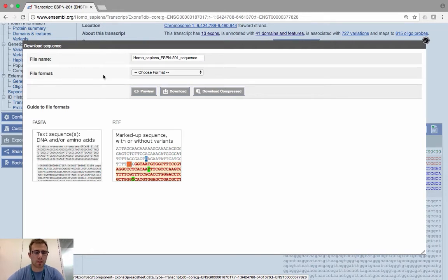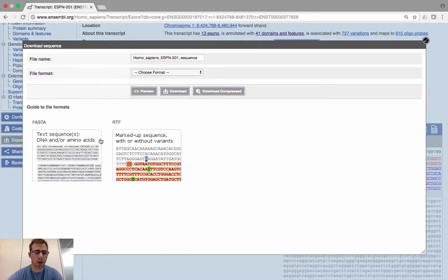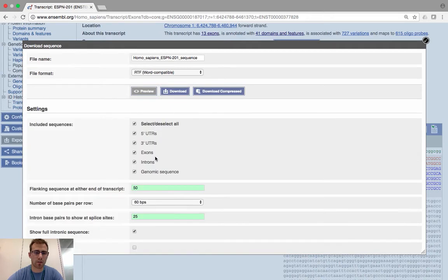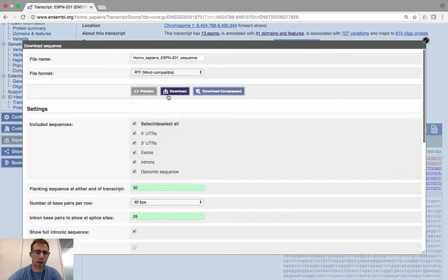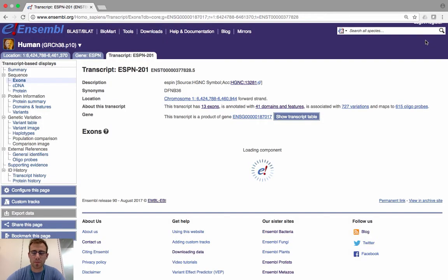If you want to download the sequence, click the Download sequence blue button at the top. You'll be presented with two format options: FASTA, which is a plain text format file that downloads the sequence without any annotation; or RTF (Rich Text Format), which downloads the sequence with all the extra annotation and letter coloring. Choose your format, select the types of sequences you want to include, define how much upstream and downstream sequence you want, and click Download — it will be saved to your computer.